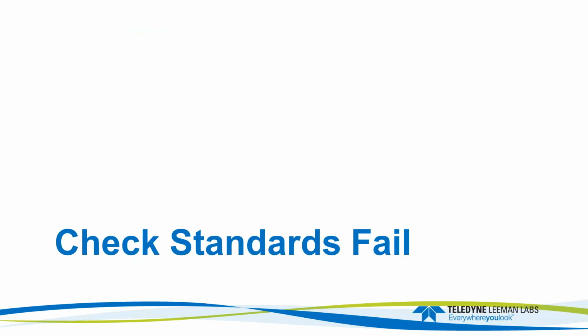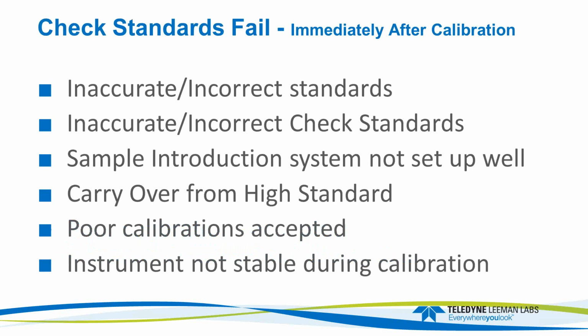Okay. A lot of times people call up and say, "Hey, my check standards are failing." All right. So immediately after calibration, right? Check standards can fail immediately, or they can fail after you've been running it for a while, right? So usually right after calibration, I always look to make sure that my standards are okay, and that the check standards are what I expect them to be, that I haven't made a mistake there.